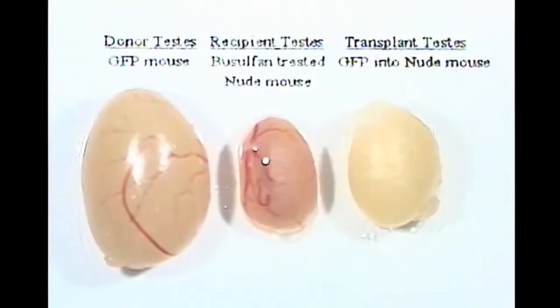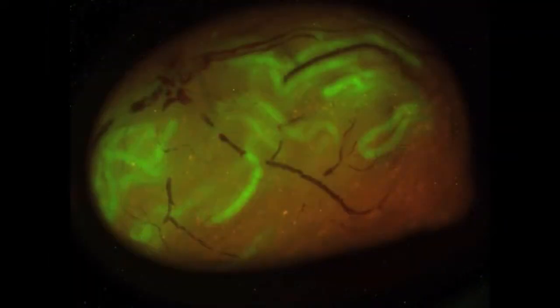Testes of recipient animals are analyzed approximately 8 weeks after transplantation for colonies of donor spermatogenesis. If donor cells contain a marker transgene, such as LacZ or GFP, donor spermatogenesis can be easily recognized in the seminiferous tubules of the recipient testis by blue or fluorescent green color. Here we show an example of a GFP donor testis and a non-transgenic recipient testis. Each colony of donor spermatogenesis arises from the clonogenic proliferation and differentiation of a single spermatogonial stem cell.